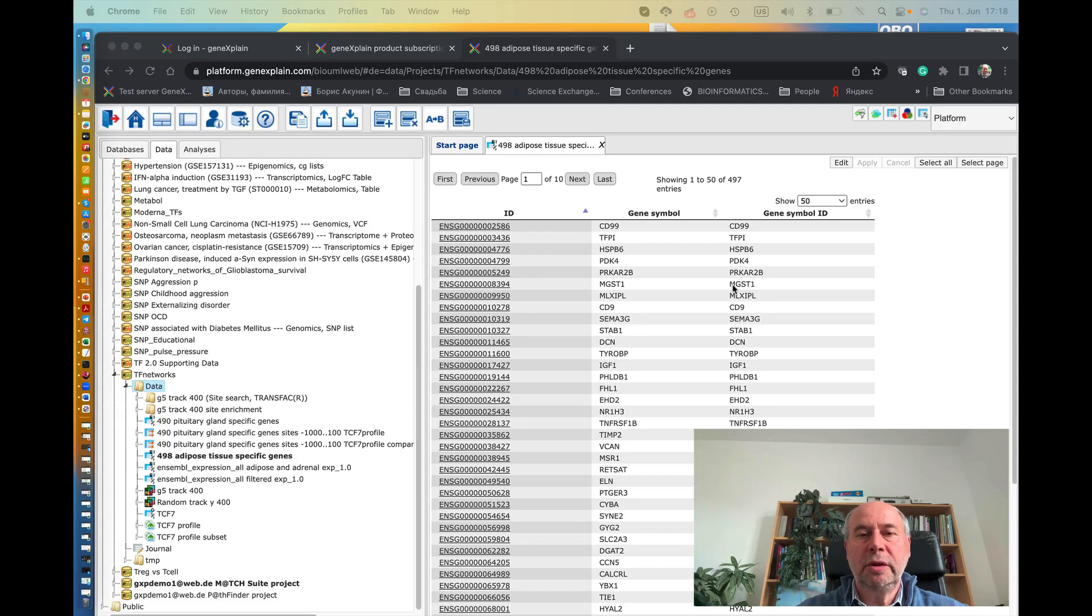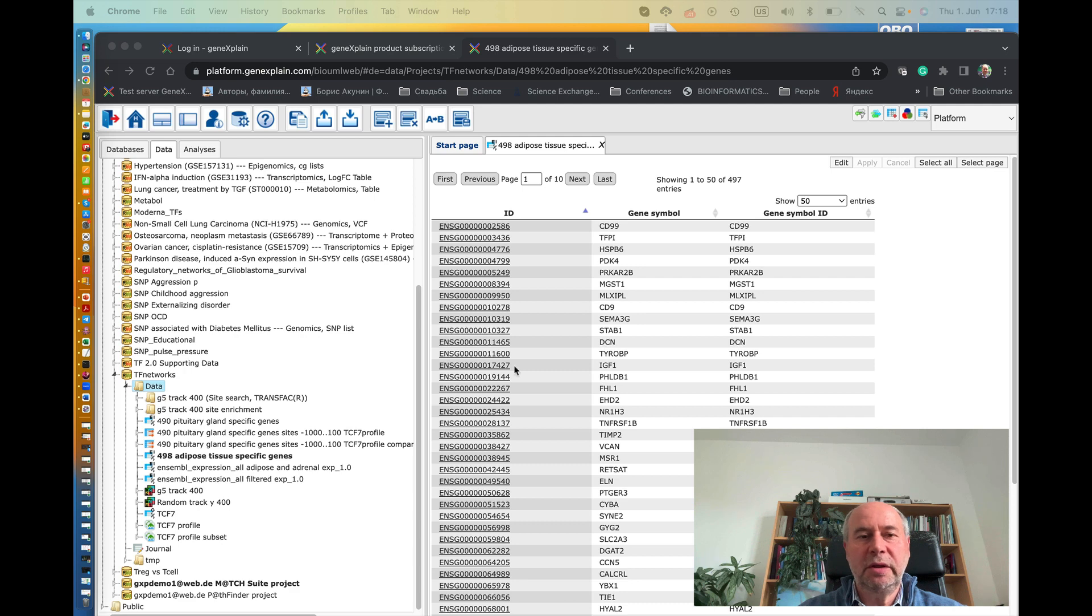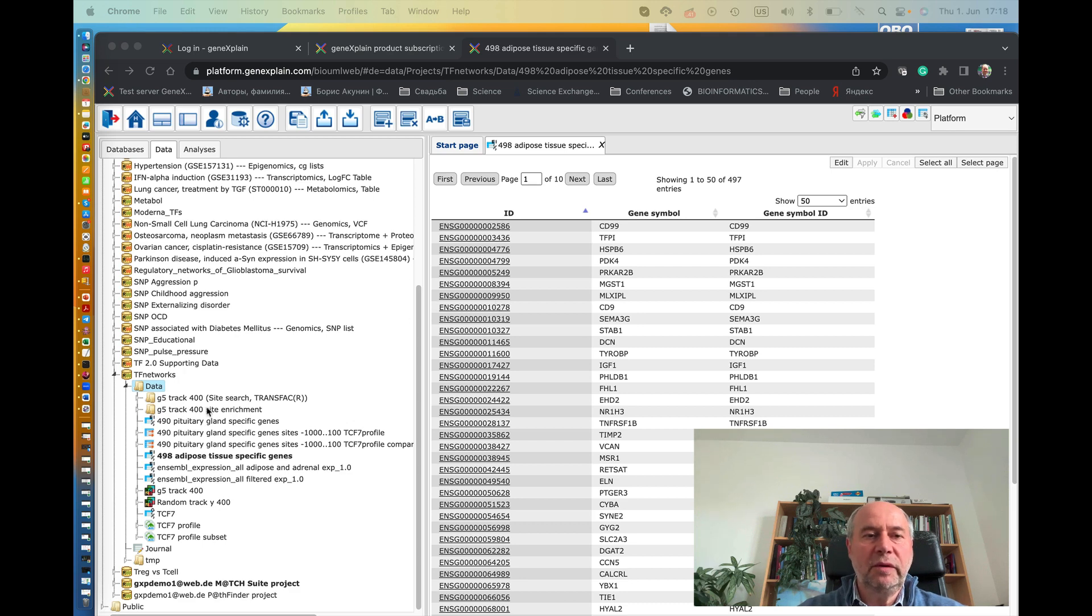How to search transcription factor binding sites for one transcription factor in your gene list. Okay, here we have a gene list of 497 genes expressed in adipose tissue, and we would like to search for binding sites for transcription factor PPAR gamma.